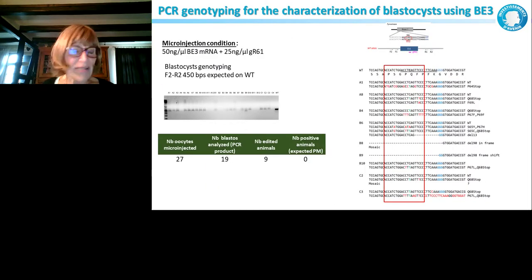And that's what we did. Then we didn't go as far as generating this animal for the 3R region, but we generated the guide RNA and the RNA for base editor 3. We first obtained animals. And after, what we obtained when we analyzed blastocysts, no, that's just on animals.